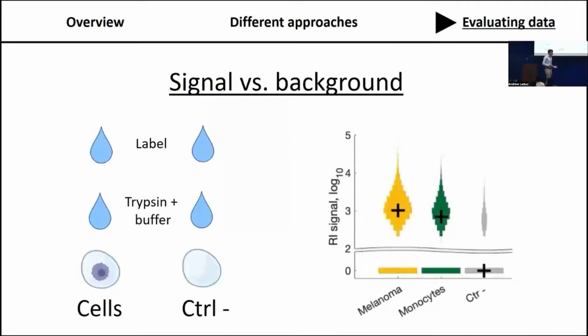So if you have confidence that you're getting strong signal from your measurements, at least in terms of abundance, and that the signal is mostly not contaminant, there's a further question of, is this signal coming from background, or is this really coming from the peptides that we're interested in measuring? And one way that we've decided to go about assessing this in our lab is to include negative controls. So in the sense of an nPOP sample preparation, these are droplets that don't receive a single cell, but receive all of the same reagents.